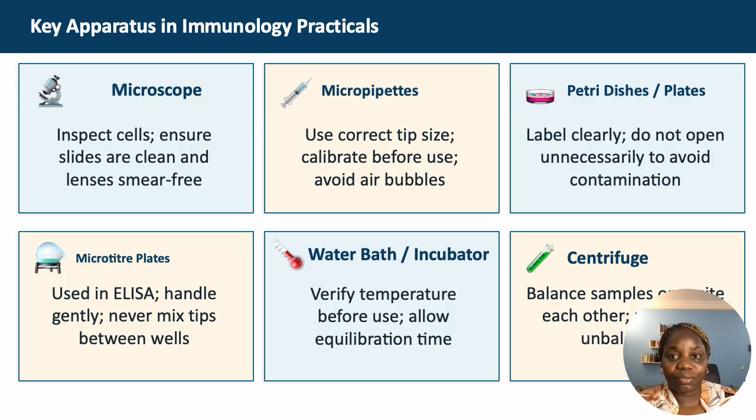For the centrifuge, an unbalanced rotor is a serious safety hazard. That is also a common mistake, to not balance the centrifuge. So pay attention. In the next practical, the complement fixation practical, you will use a water bath.